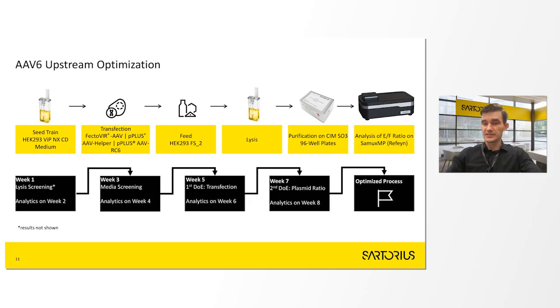The plates and the SAMUX are quick, so we can rapidly go back to our bioreactors and optimize our run to further improve our production process. In the picture below, we can see how the whole process looked.